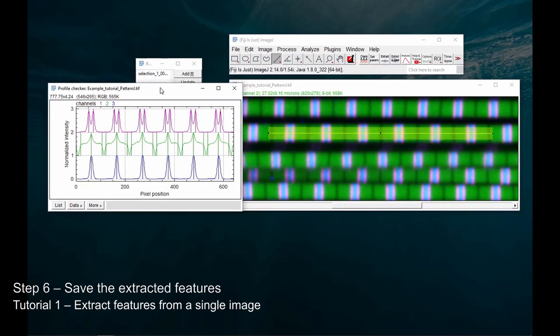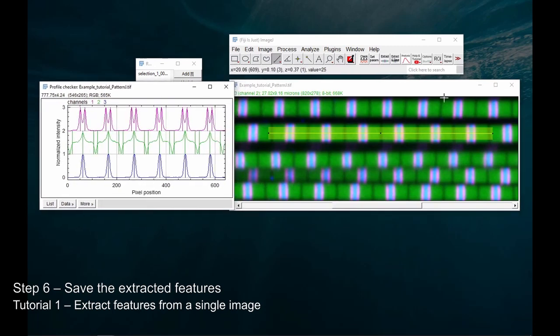If unfortunately the algorithm did not fully extract the position of the features, try to modify the selection, making it smaller or larger. It is possible, if the noise is too large, that sparse positions are extracted. 2 solutions usually work. The easiest would be to use an optional feature of PatternJ, which consists in applying a Gaussian blur to the image. The other option would be for you to use a convolution, either through dedicated software, or using ImageJ, which also offers the convolution.